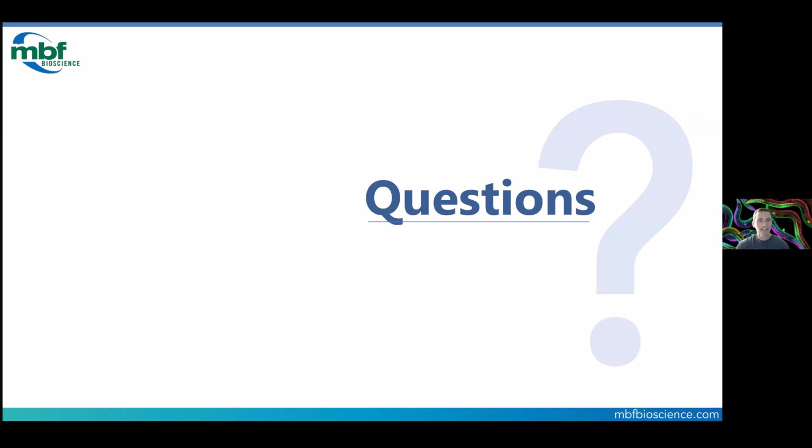We have an old version of WormLab. Kindly help to update it. Well, you can definitely get the latest versions of WormLab available from our download center. We do offer software upgrade support subscriptions, which allow you to access the latest versions of software. And as I mentioned, we have a new version coming out momentarily. So you should be able to take advantage of some of the latest features by downloading that latest version.